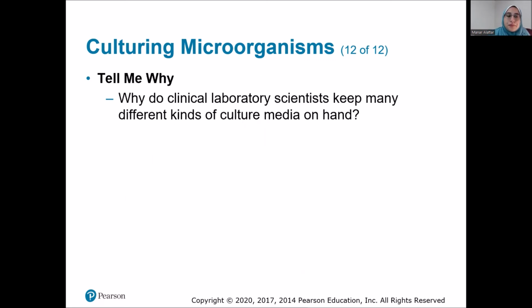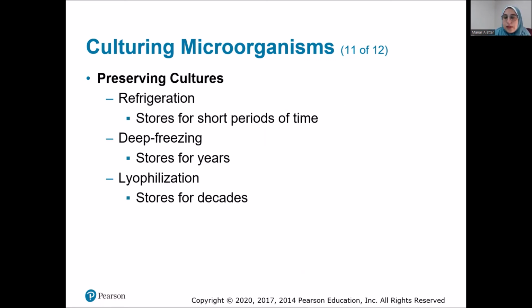And so with these different techniques that we've discussed now, that are your very specific, your complex, your selective, and your differential, and sometimes combinations of those, also using transport media to get that sample where it needs to go so it can go through those various different tests. Oftentimes then you still might need to save a sample, right?